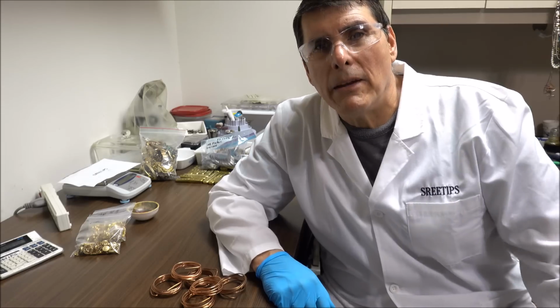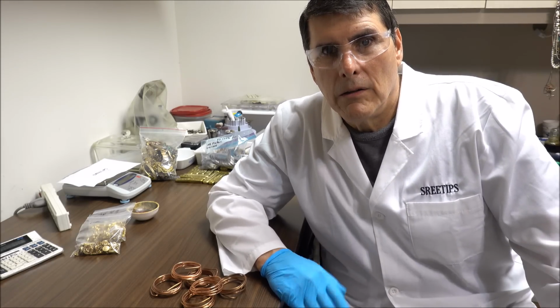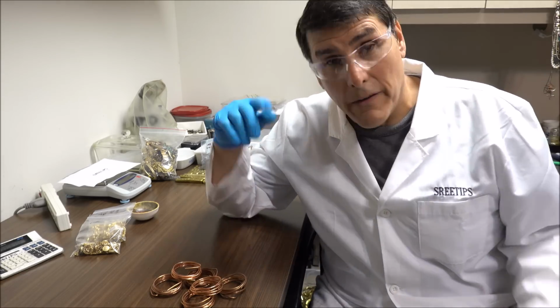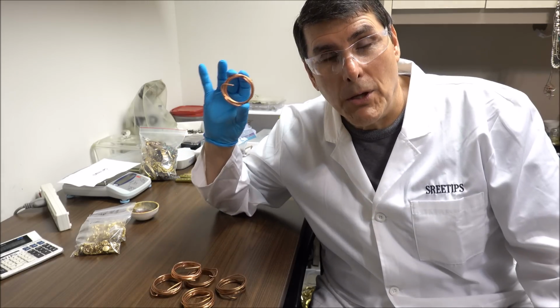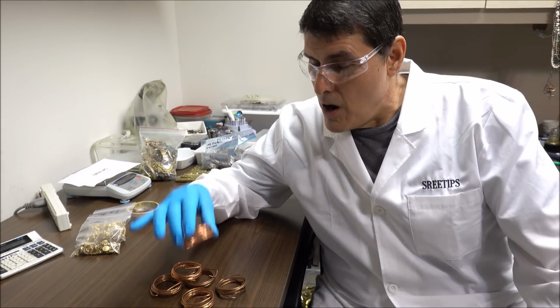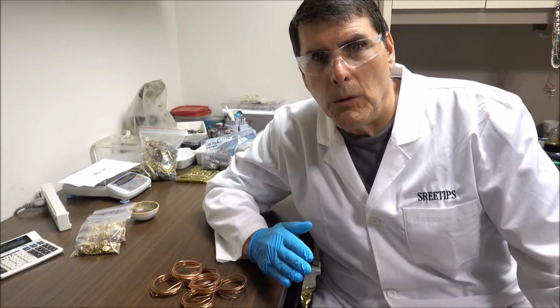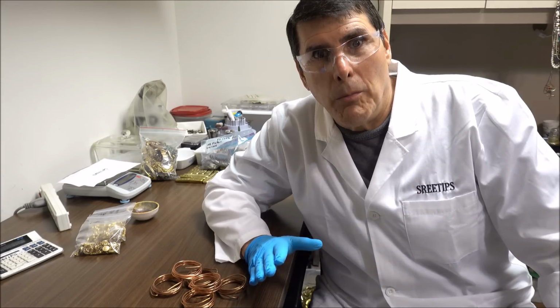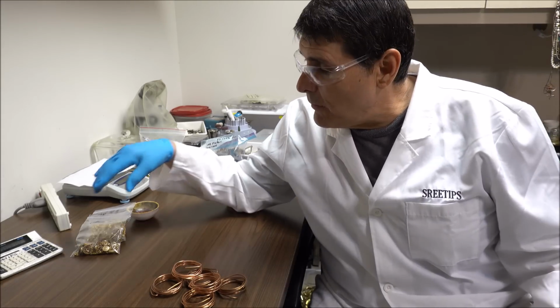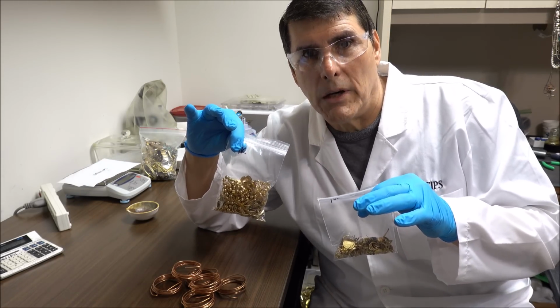So in order to make those hot nitric acid treatments work, the first thing we have to do is alloy some silver, or in this video, I'm going to be using copper, because silver and copper are both soluble in nitric acid. So what I'm going to do is add some metals that are soluble in hot dilute nitric acid to the carat gold to get the gold content down around 25%.